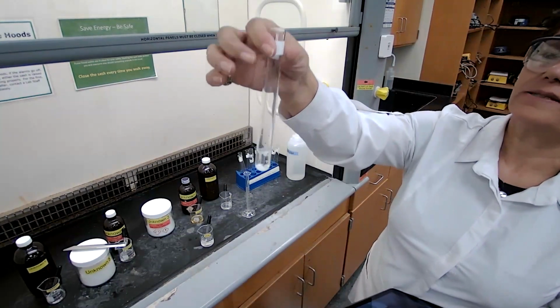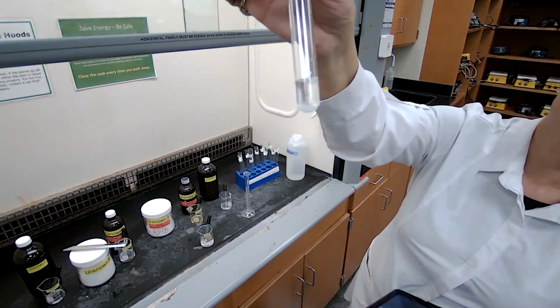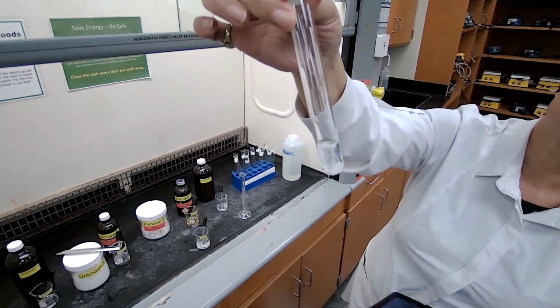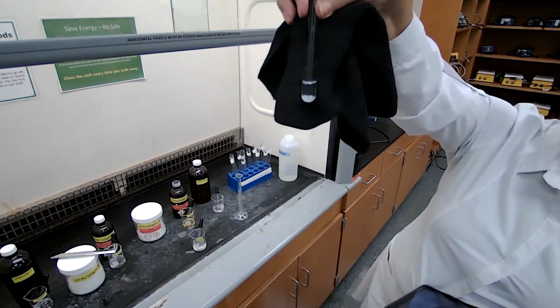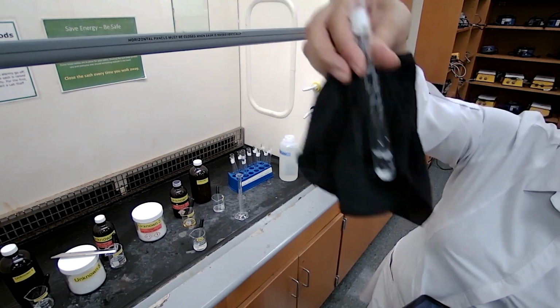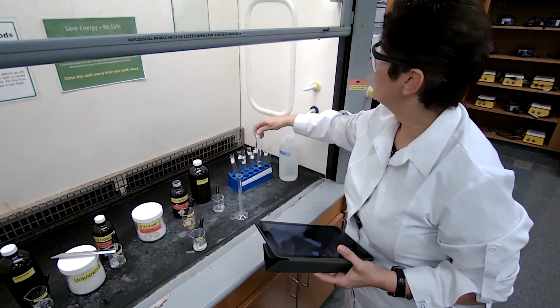Now, unknown 3 is a solid compound. This one is easier because you can see that the solid did not dissolve. So this one is also not soluble in water. I hope you could see better with the black background. So no pictures needed for this one. That's unknown 3, not soluble.